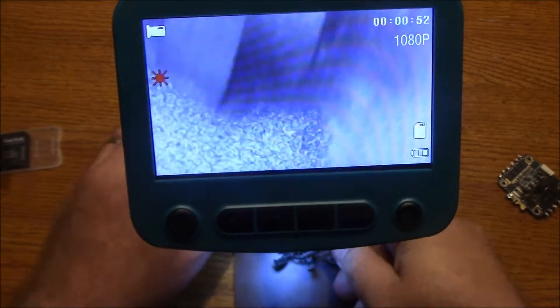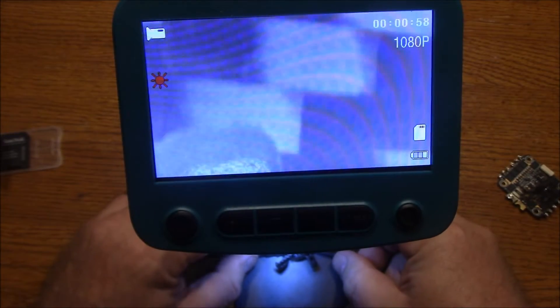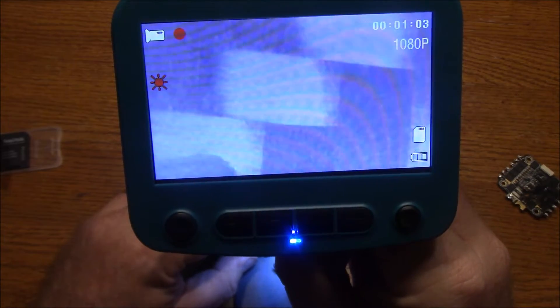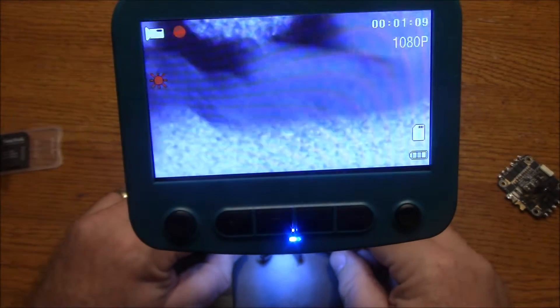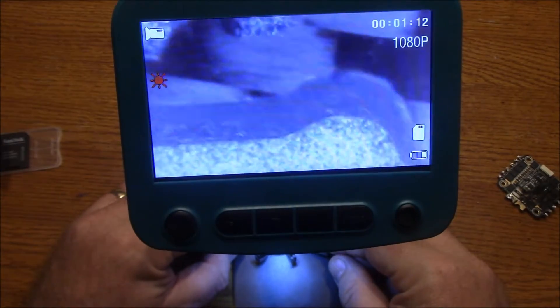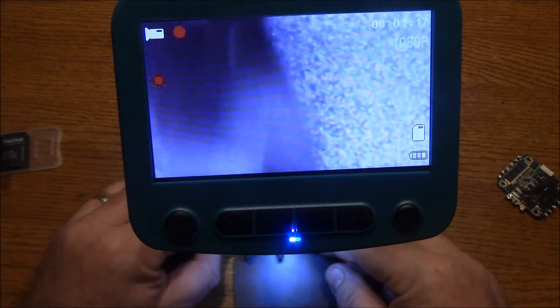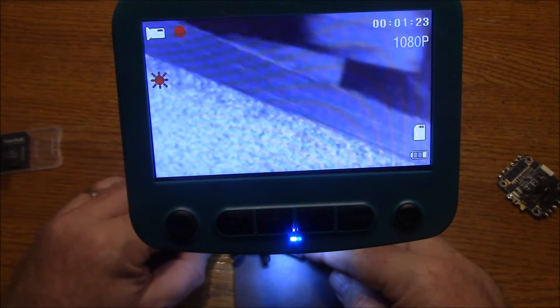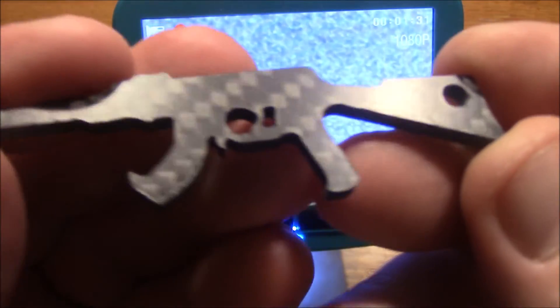Here's the carbon fiber AK, and if I put this under here it looks kind of white, but you have to turn it a little bit so the light doesn't reflect on it quite as badly, then you can see the actual fibers inside. I have to adjust the focus a little bit. The carbon fiber looks like it's actually decently cut, except for some parts back here where it looks kind of bad. But we're also looking at this at a huge magnification level. When you look at it up close it looks fine, but put it under the microscope and you can actually see all the imperfections.